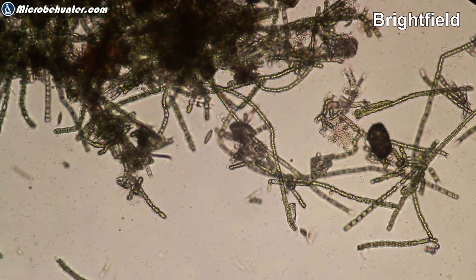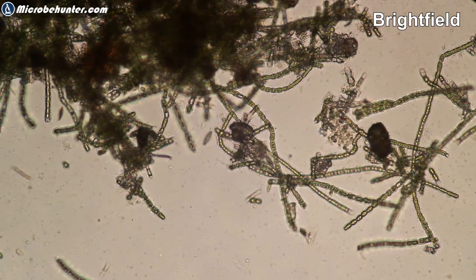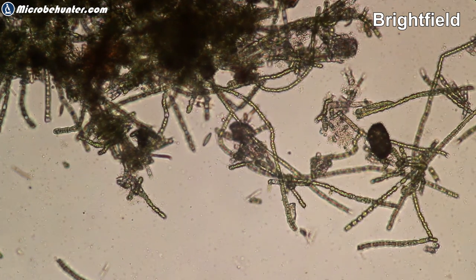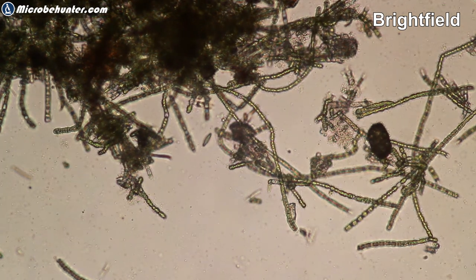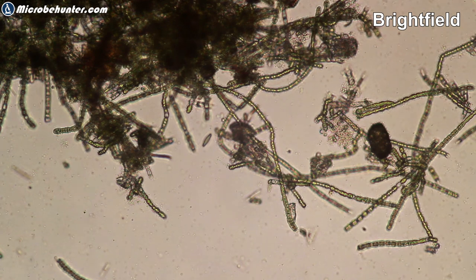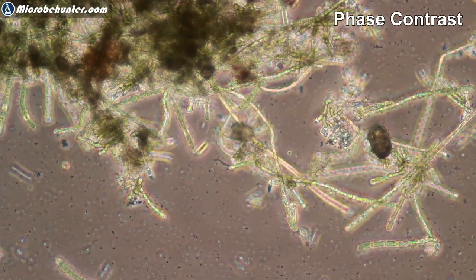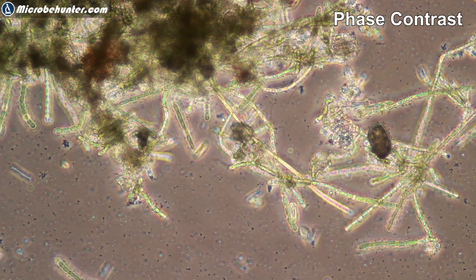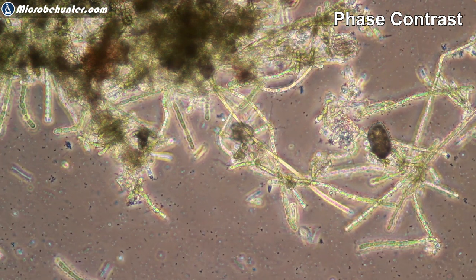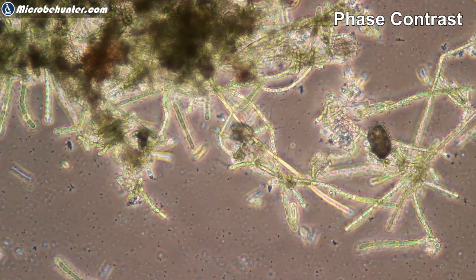That's in bright field, a water sample. I'm going to switch over directly to phase contrast now to also show you how it looks like in phase contrast. And here we go. That is now phase contrast. Maybe you have not noticed, or maybe you did, but look at the liquid, not at the algae, but at the liquid. And you see those dark dots, small dark dots. These are bacteria.